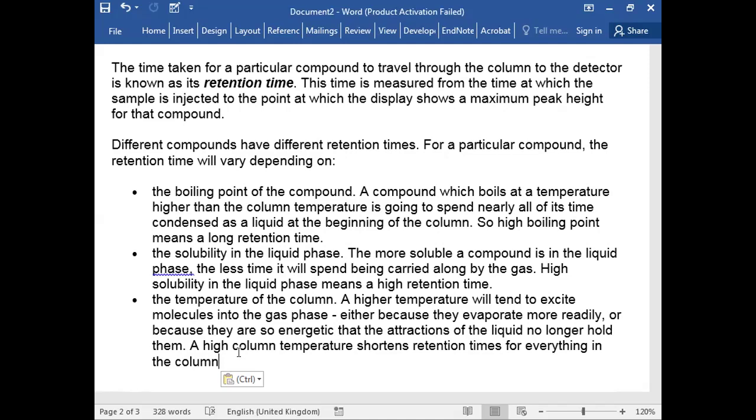For example, water is highly polar, water उसके अंदर dissolve नहीं होगा लेकिन उसके ऊपर condense तो हो सकता है. So these are the three things that can happen to any particular component that you insert in a gas liquid chromatography. सही है?